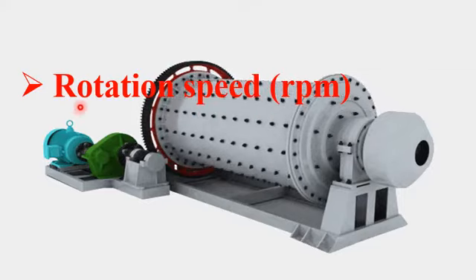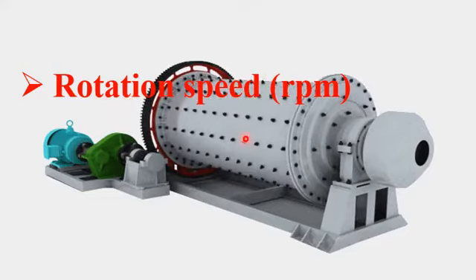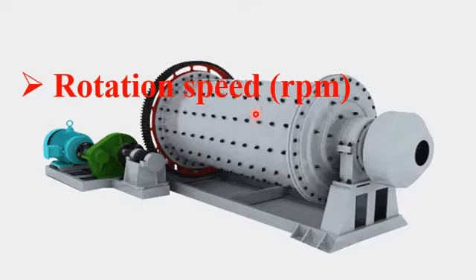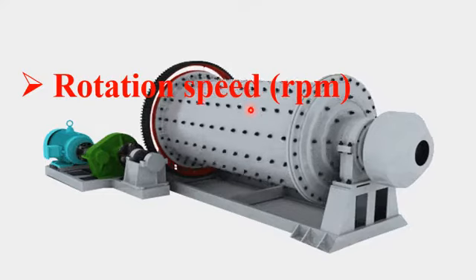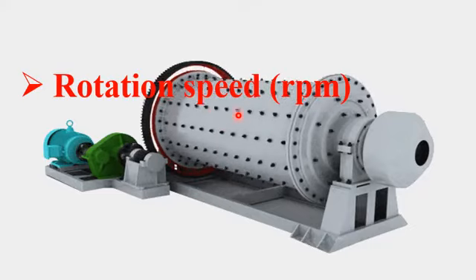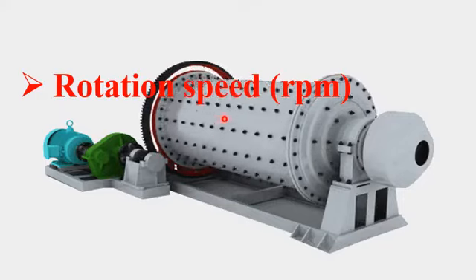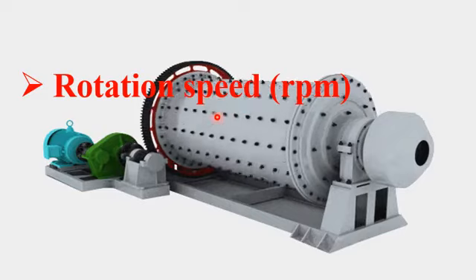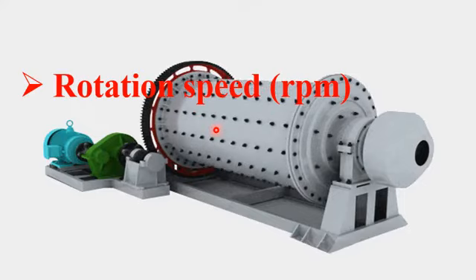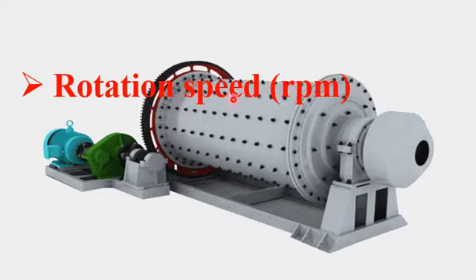Okay, so please note that rotation of the drum opposite to the revolution is an effective way to get very fine nanoparticles, and these nanoparticles will be more mechanically active, and they are well mechanically alloyed, because the impact energy of the balls will be higher on the bulk material due to the opposite rotation of the drum with respect to the revolution.